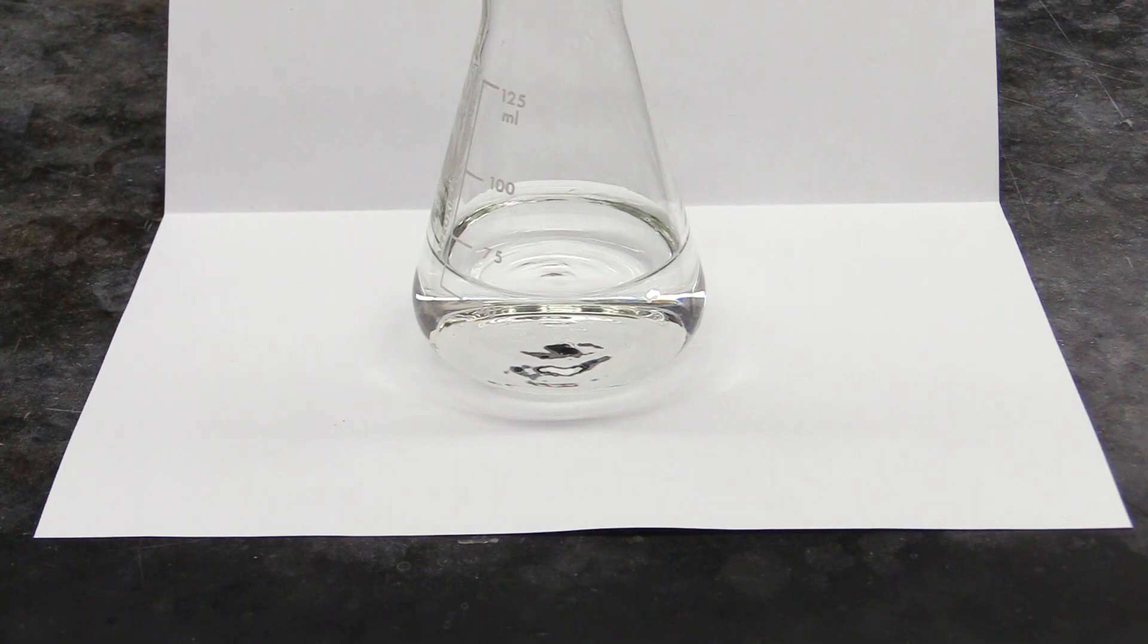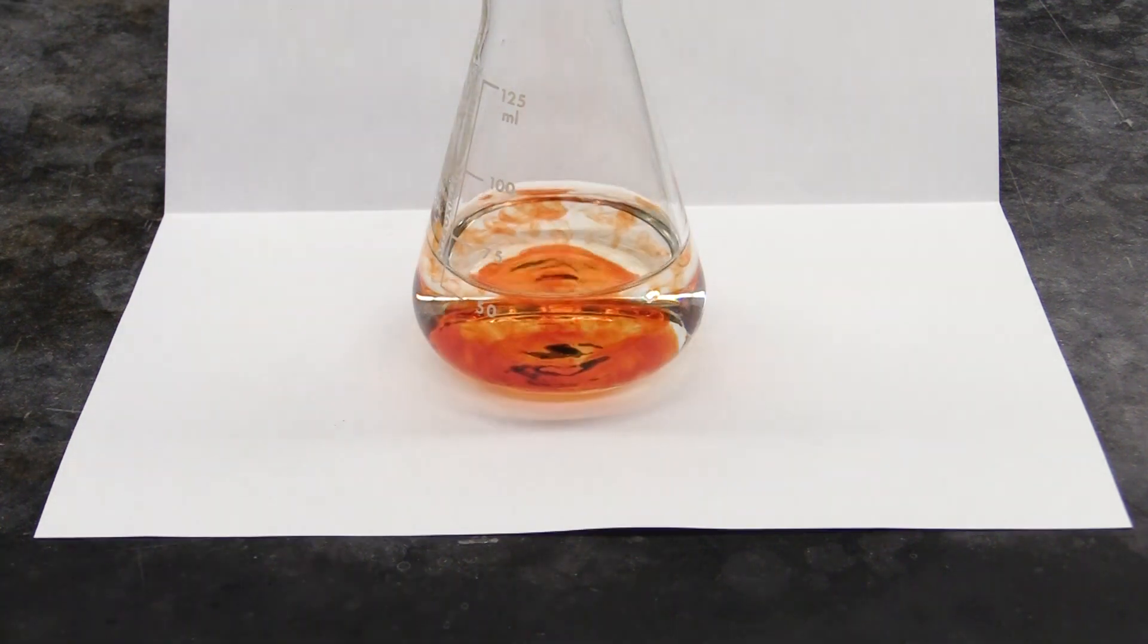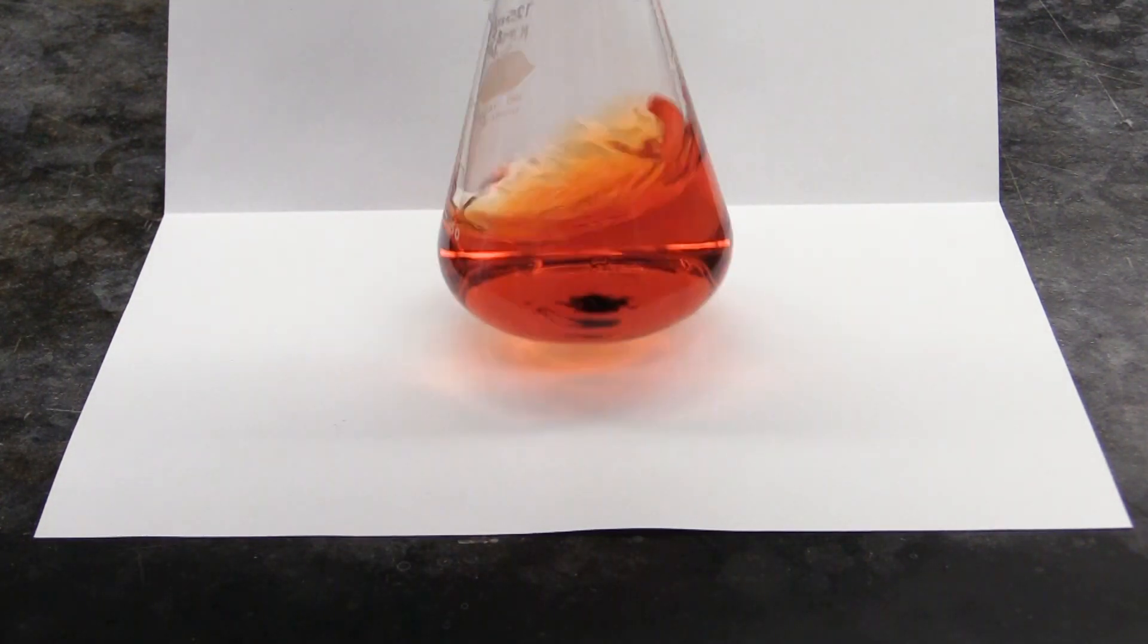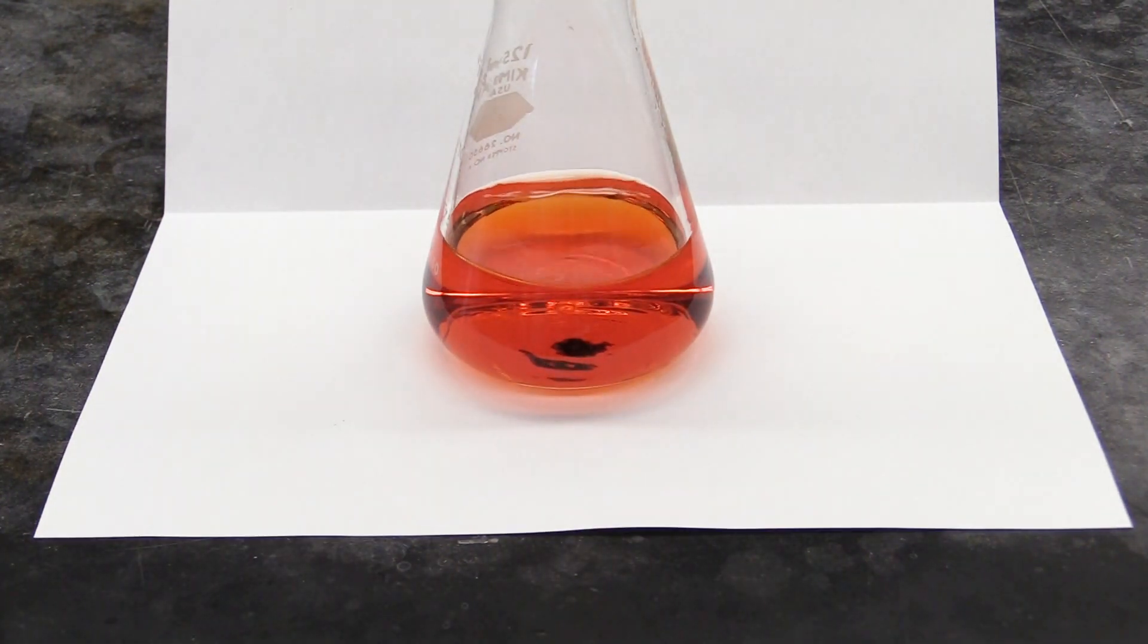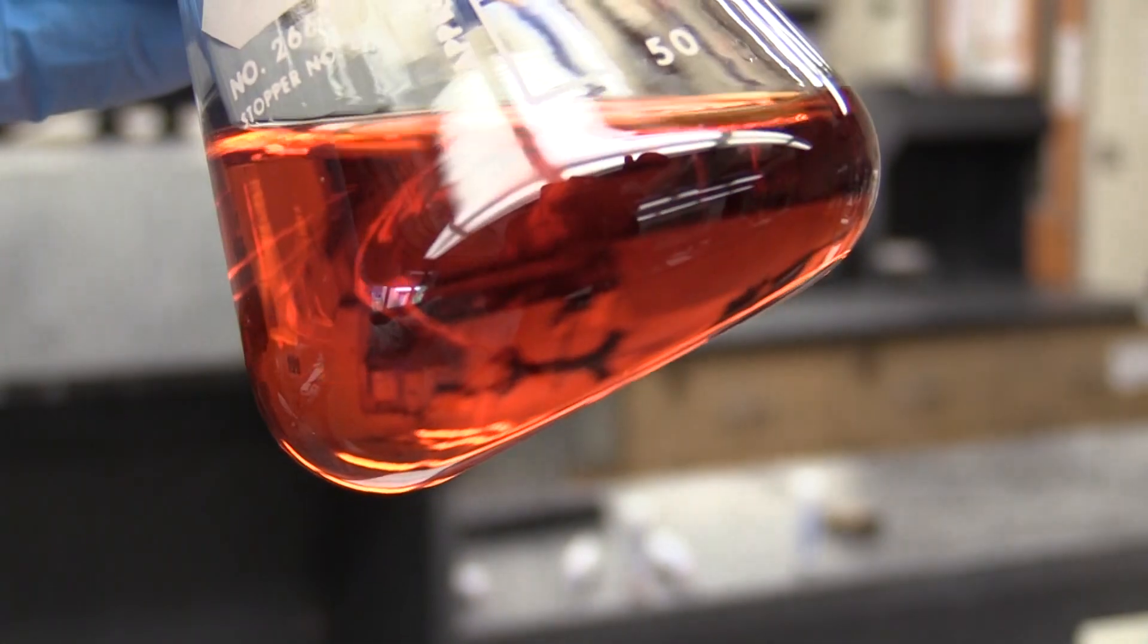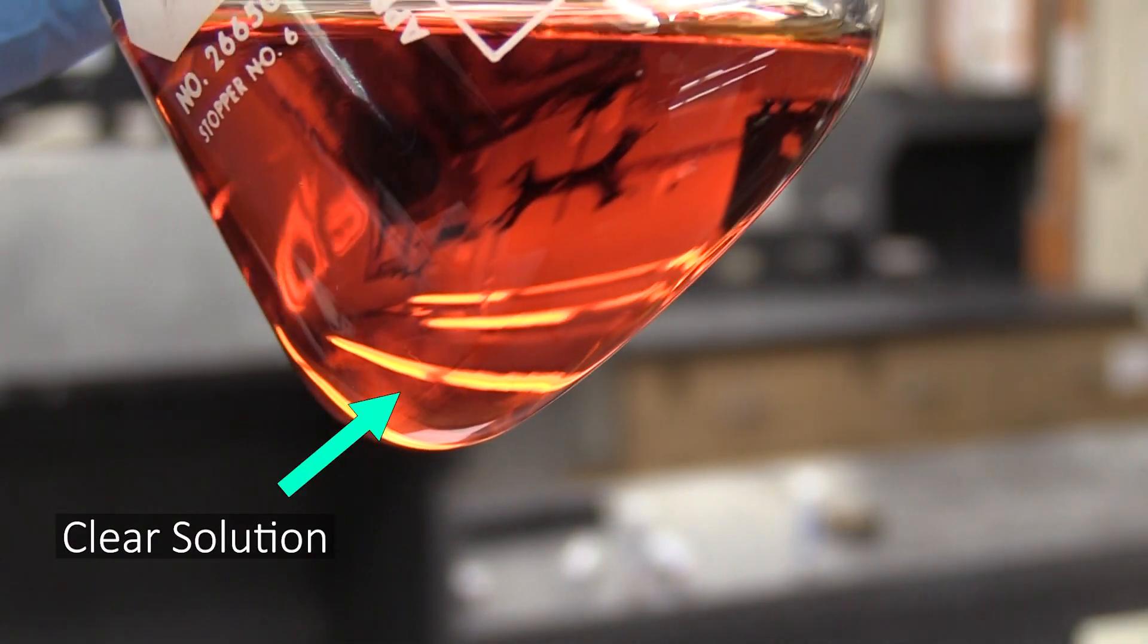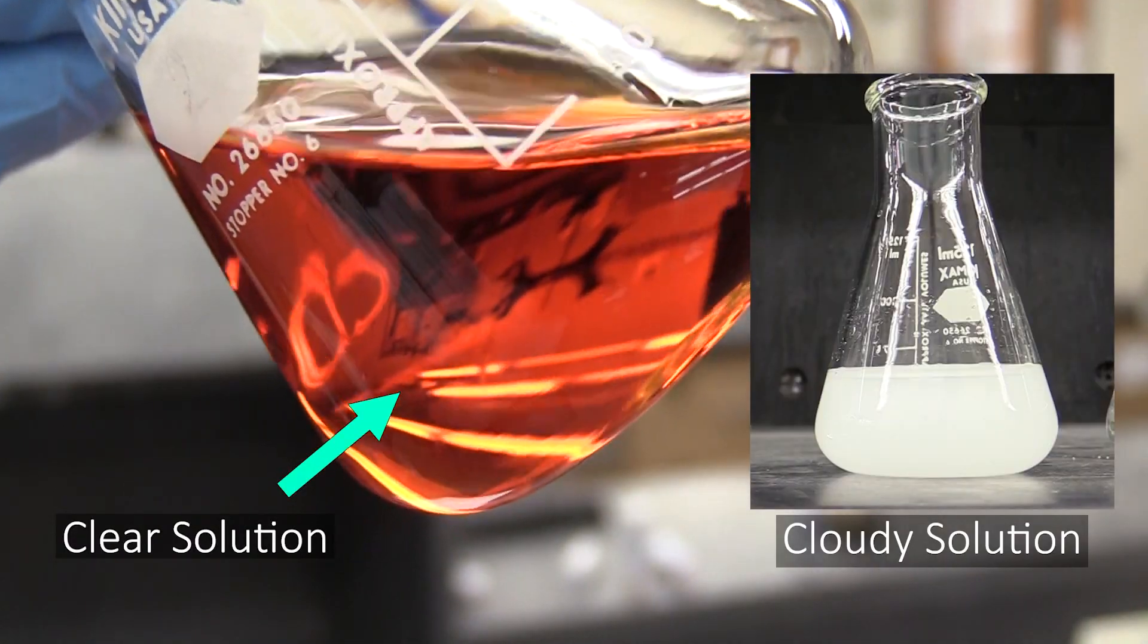In this example, you can see the solution here is initially colorless, but if we add another solution that is also colorless to it, we get a reddish color. However, we can do better than simply saying the solution was colorless and then became red. Even though it changed color, it's still clear and not cloudy like the contents of this flask, so you could note that as well.